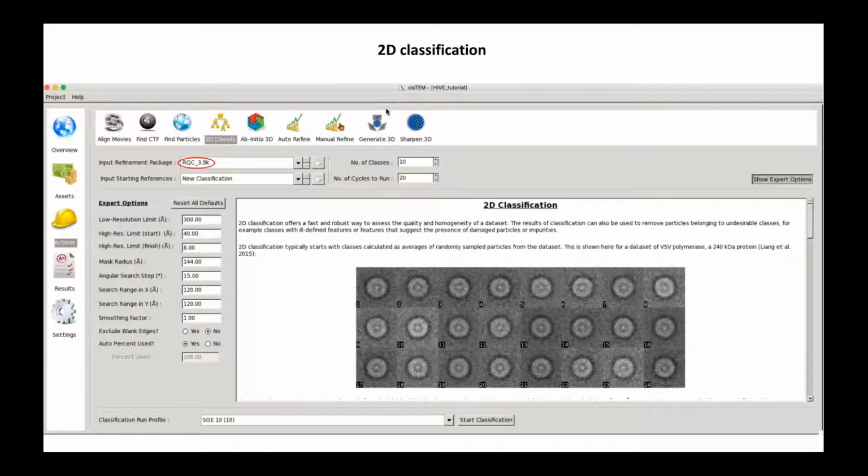Do you think that generates different conformations? You're going to have class averages that will provide you different orientations. 2D classification will show you how these particles are displayed in your image. You don't have orientation values, whatever is homogeneous in the 2D image. So we do either conformations or orientations. Right.